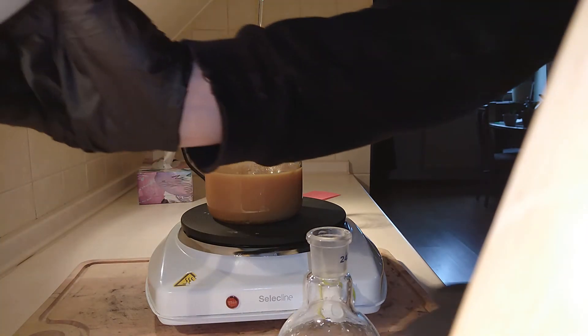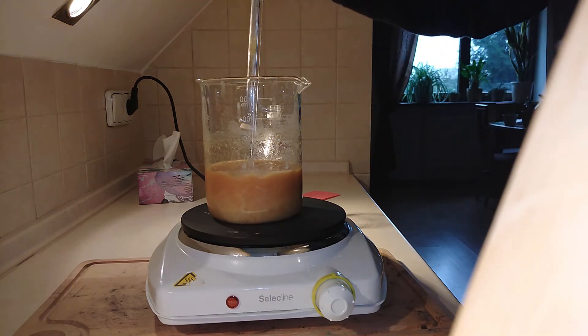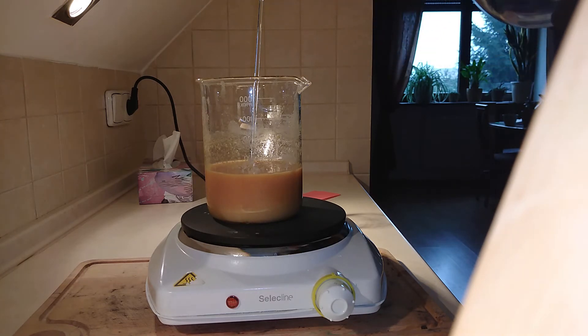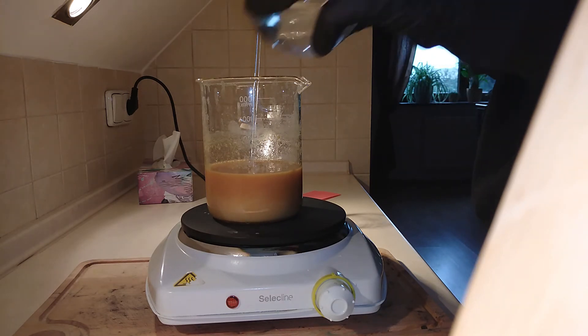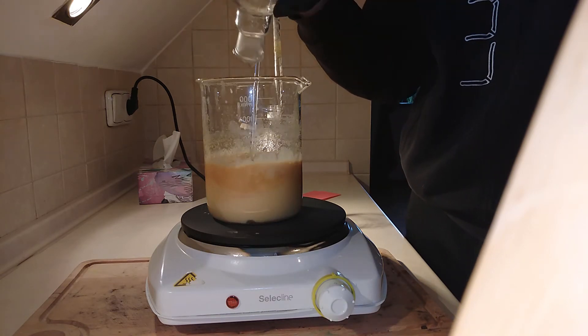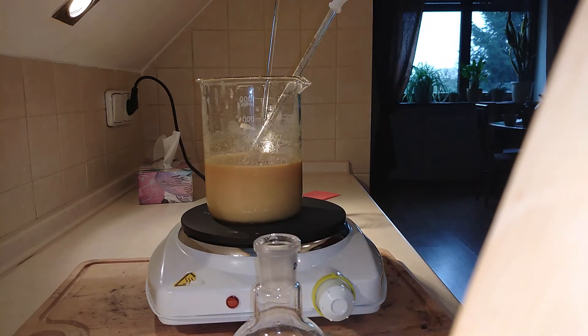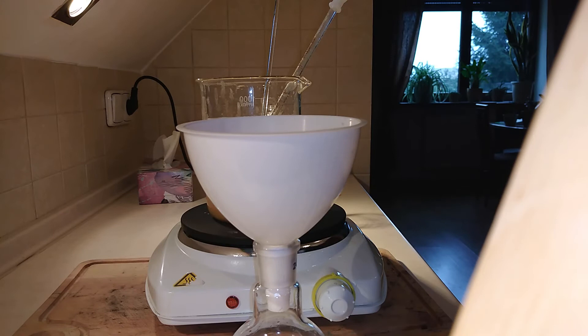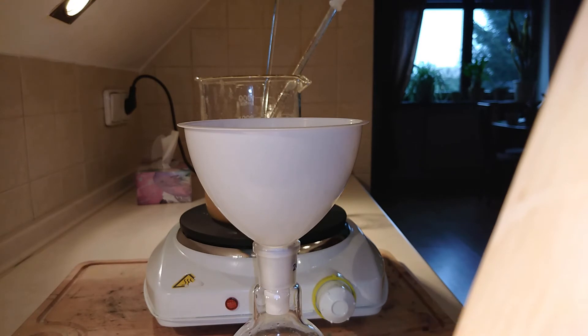I'm going to do it by adding water, because dibenzalacetone is completely insoluble in water. Now I'm adding water to the mixture, and this is the most we're going to ever get from the solution. I'm going to try getting out even more, because adding more water doesn't do any harm — even if we add too much.